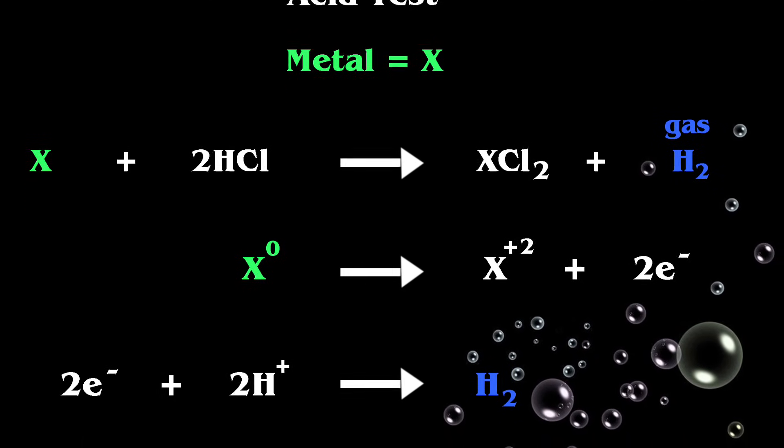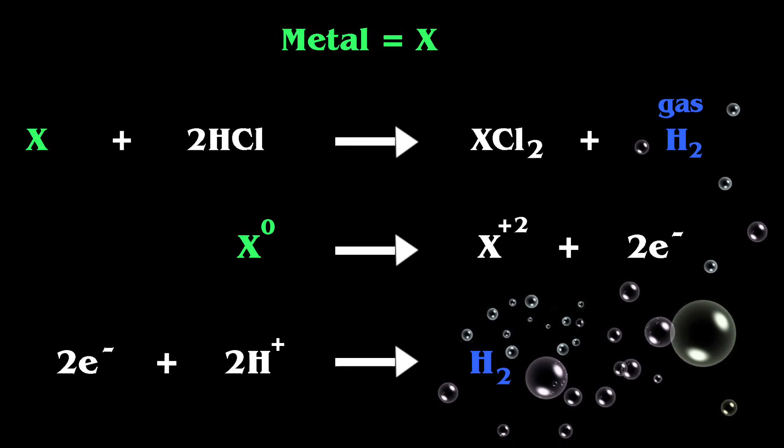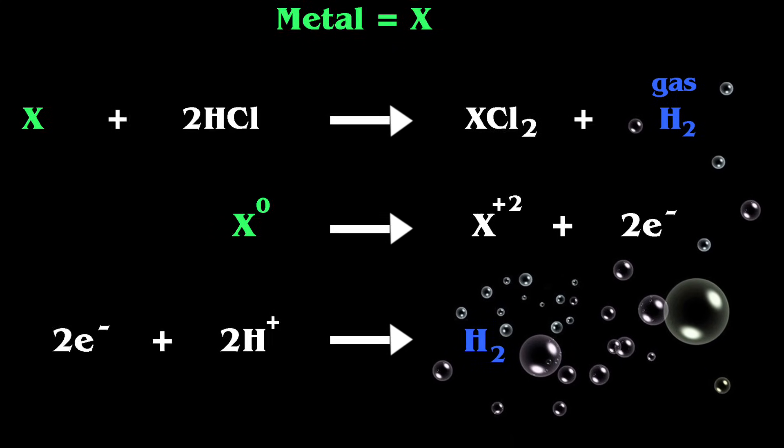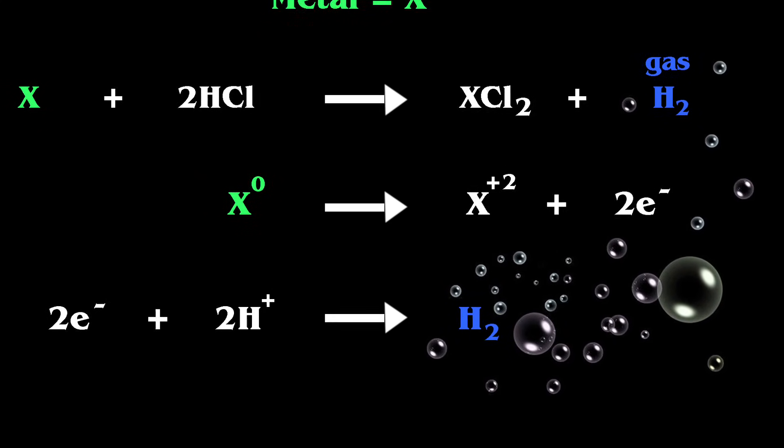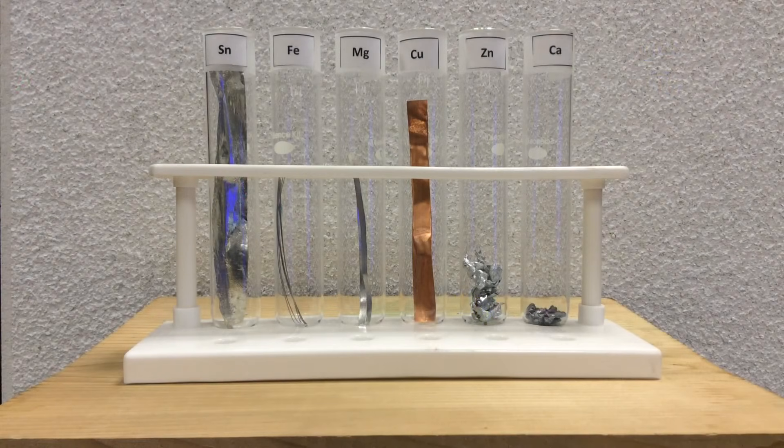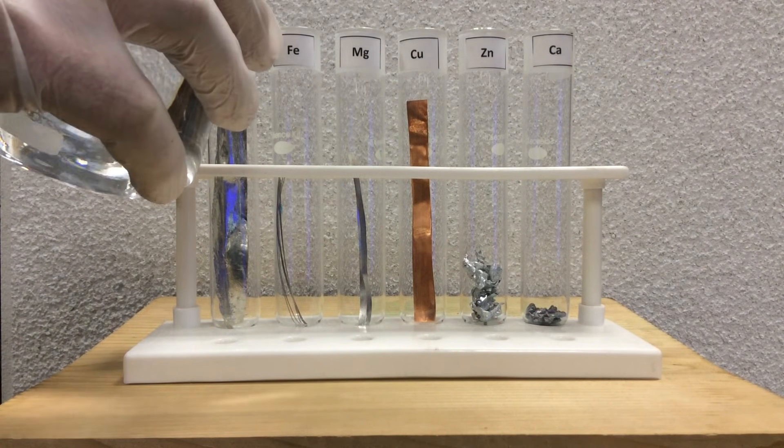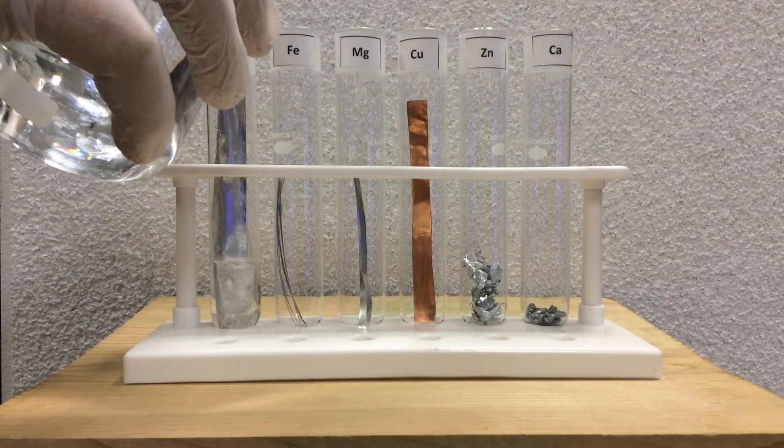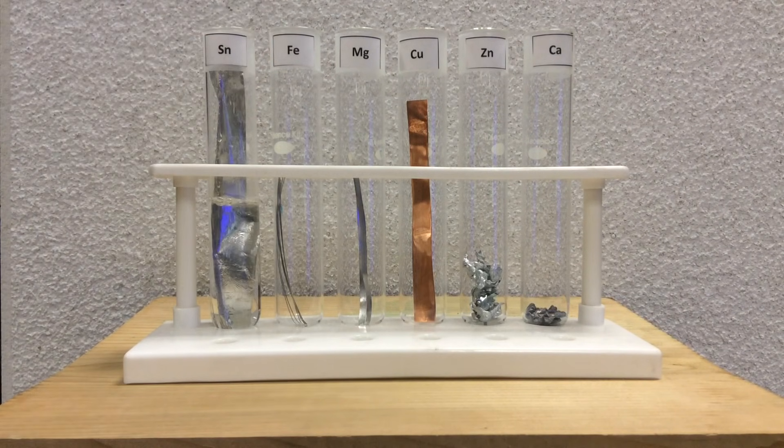As you can see in the half reactions, two electrons are going to be passed from the metal to the protons to make free elemental hydrogen gas. We're looking for observations to make here as I add the hydrochloric acid. And we're looking for bubbles.